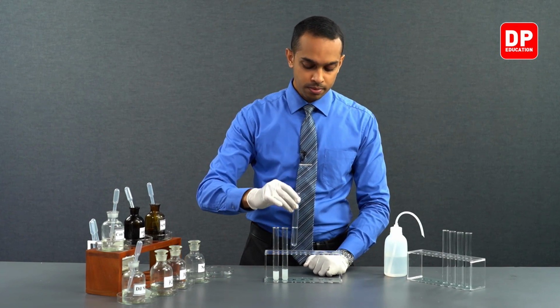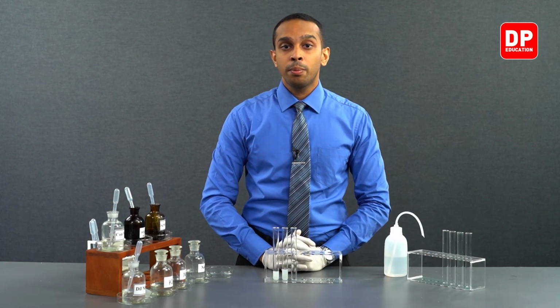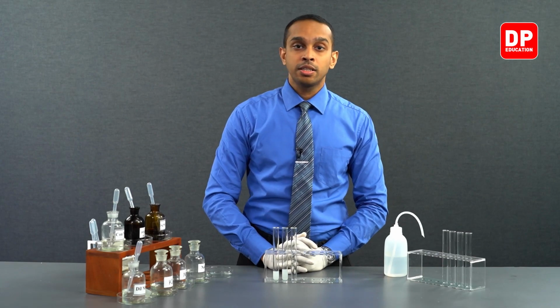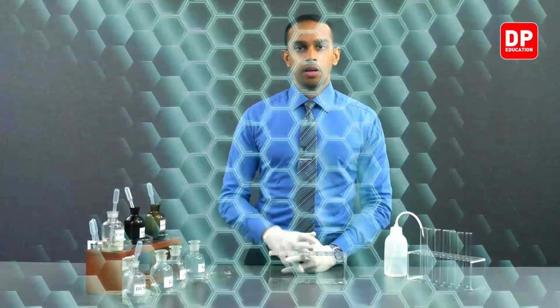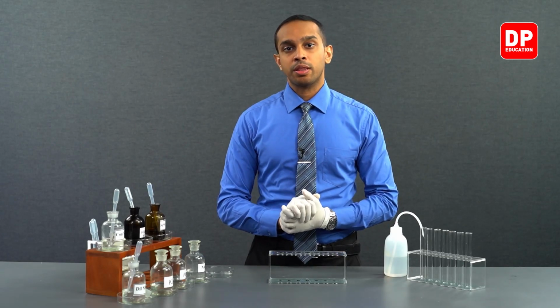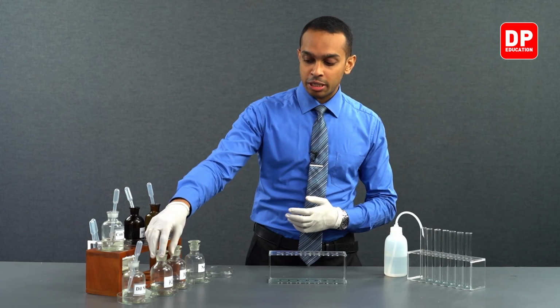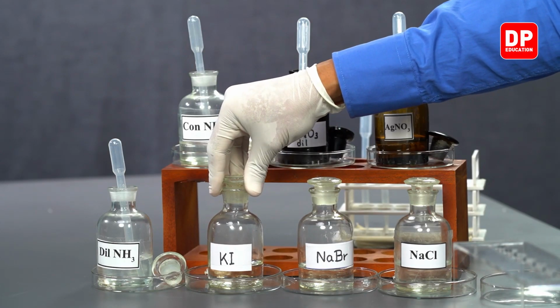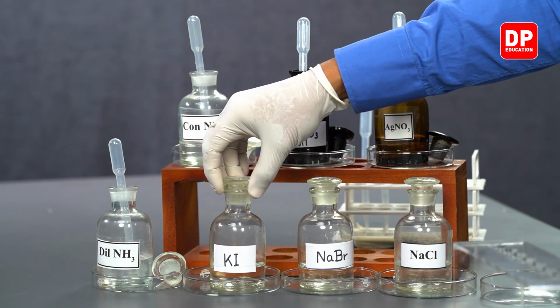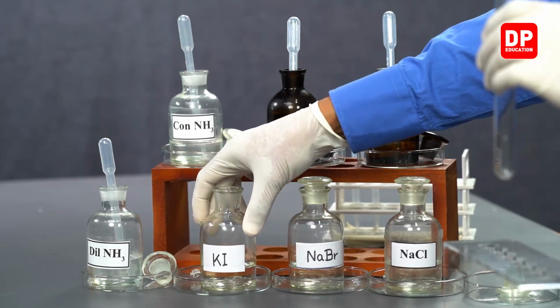So that is it for bromide ions identification test with silver nitrate. Now let's see how iodide ions react with the silver nitrate solution. So to introduce iodide ions into the solution, we will be using potassium iodide. So we will take a little bit of potassium iodide solution into this test tube.